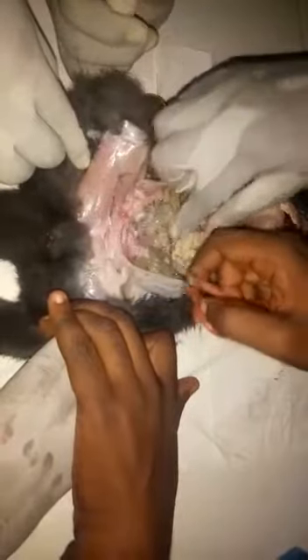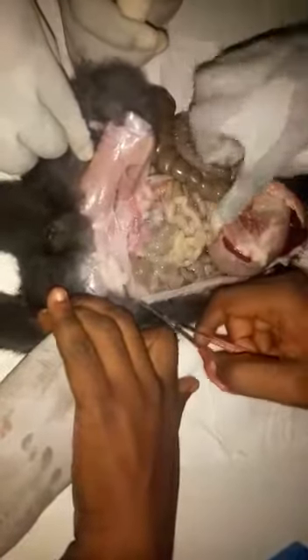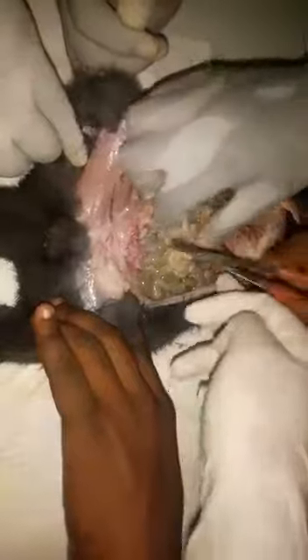So, left. I think there's the left. Then there's the liver. See the liver. Urinary bladder. Identify the liver here. Okay, kidney. There's liver also here. The urinary bladder. This is the small intestines. Here is the large intestine.